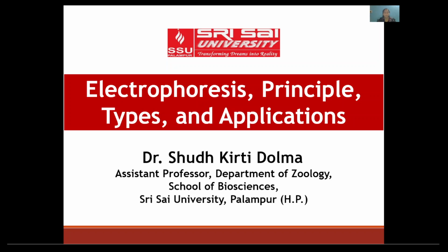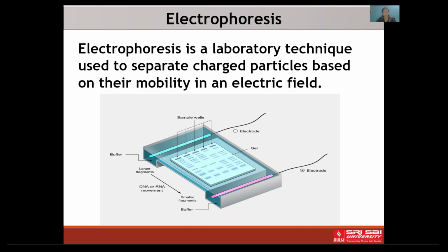Today we will explore an essential technique in biotechnology and molecular biology, that is electrophoresis. This technique is foundational in separating and analyzing biomolecules like DNA, RNA and proteins. First of all, what is electrophoresis?